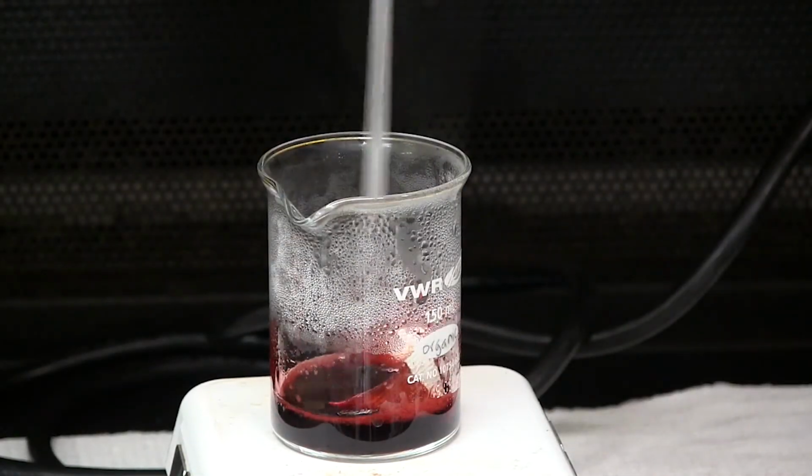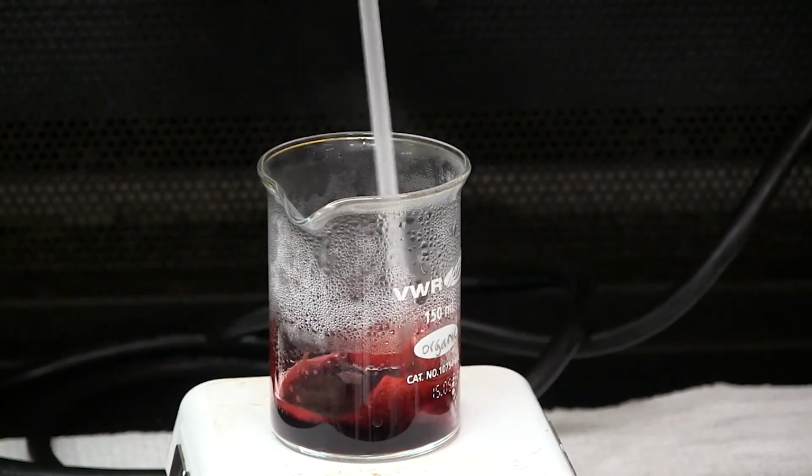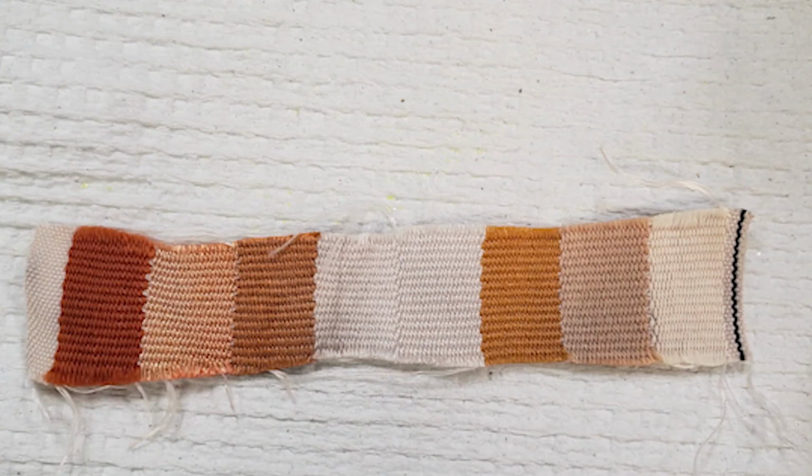Remove the fabric from the dye bath and allow it to cool for 5 minutes, then wash it thoroughly under cold running water. Pat the cloth dry with a paper towel.